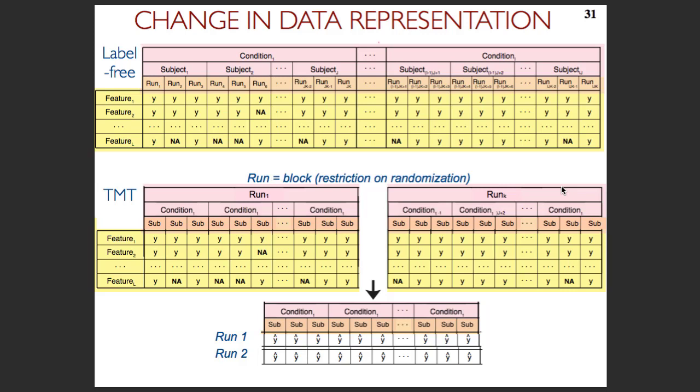Basically, isolation means you can have two peptides. One is very abundant, the other one is very low. For example, the low abundant one will give out, let's say, 2 to 1 to 1 to 1. But the housekeeping one will have 1 to 1 to 1 to 1. And the 1 to 1 to 1 will distort the low abundance ratio.